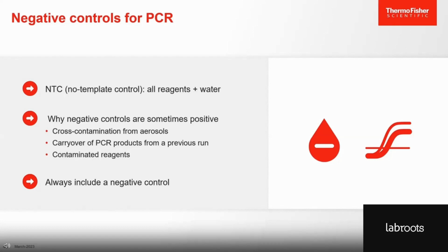Now, one issue that I come across at Thermo Fisher Scientific that people ask about fairly often is trouble with the negative control if the assay is designed to detect bacterial DNA. The source here is usually the DNA polymerase. Most of them are recombinant enzymes, which means that they are produced by expressing them in E. coli and then purified from these bacteria.